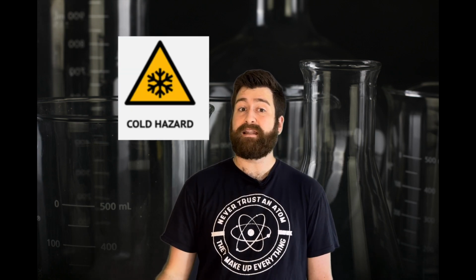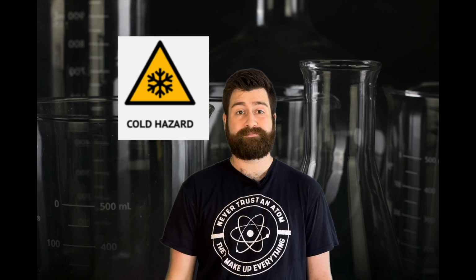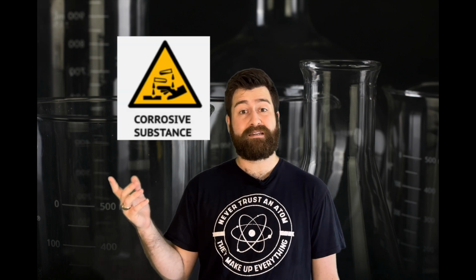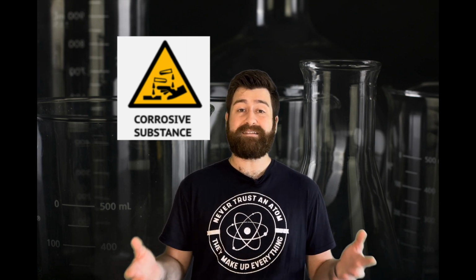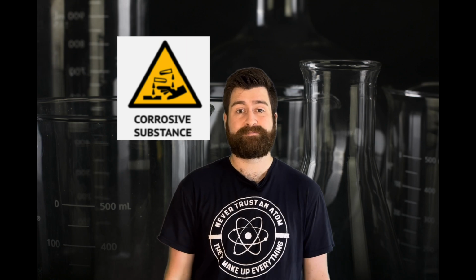This symbol means the substance is a cold hazard. Something like liquid nitrogen may use this safety symbol. This symbol means that it is a corrosive substance. These eat through things, so you don't want to get them on your skin or certain materials. Acids are an example of corrosive substances.